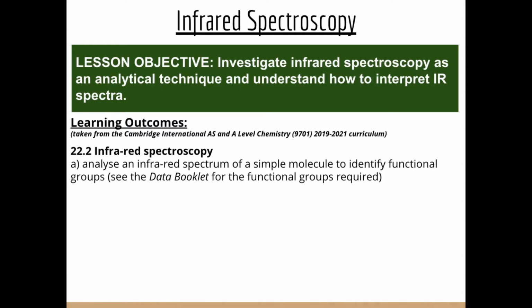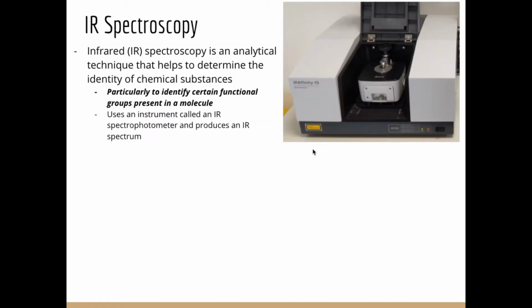G'day, welcome to the one and only lesson in our final unit looking at analytical techniques. In this final lesson, we're going to look at infrared spectroscopy. For our lesson objective, we're going to investigate infrared spectroscopy as an analytical technique and understand how to interpret IR spectra. So when it comes to organic chemistry, organic synthesis is one part of the challenge.